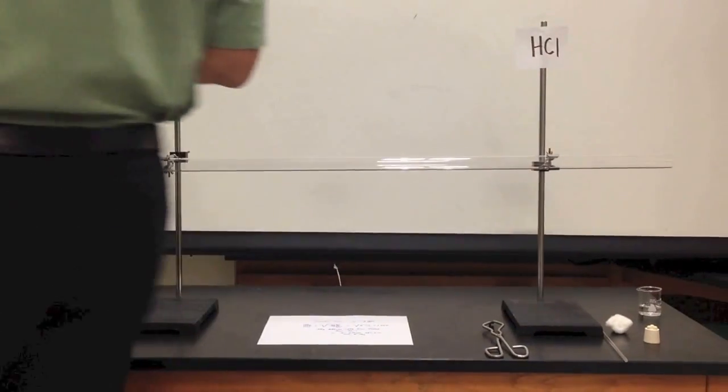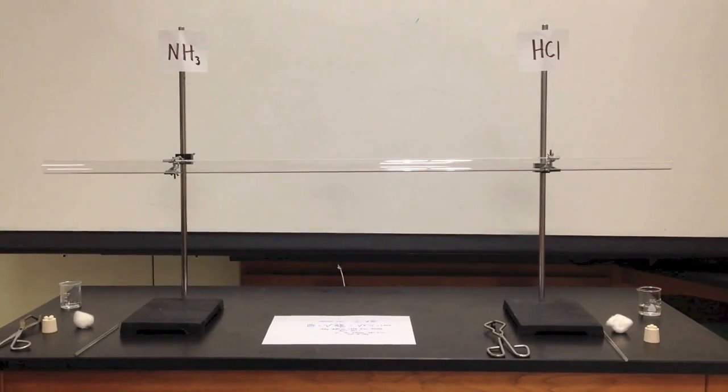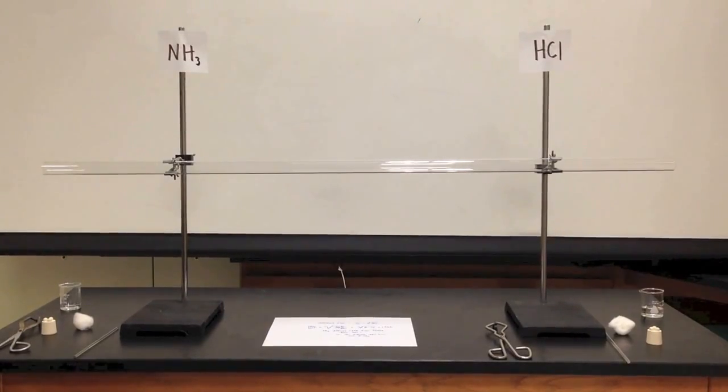I'm going to start with ammonia and hydrochloric acid, and I'm going to start with the heavier gas. Hydrochloric acid is 36 grams per mole.